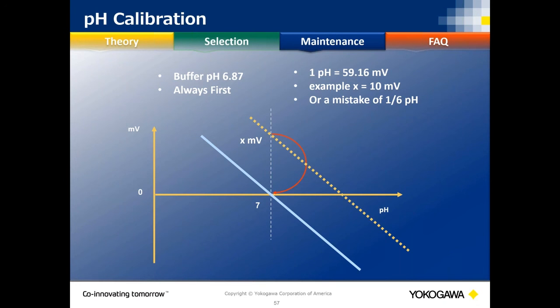a half a pH offset right away. So at about 15 to 20 millivolts, you need to clean it again. At 35, you're going to start to get sluggish. Analyzers vary. They will alarm at 60 millivolts. They'll alarm at 120 millivolts. You can bring it in if you want. But pretty much if you get to 80, 85 millivolts, you need to look at, if cleaning's not the issue, starting to replace your electrode, okay?